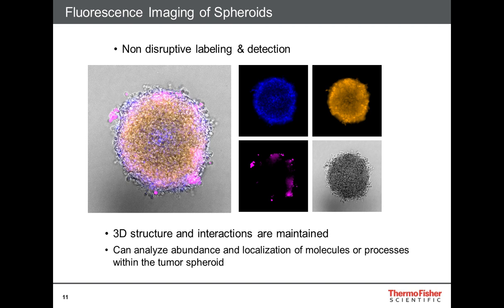So two things that are critical: counting our cells and then using an appropriate plasticware to grow a nice round spheroid. And so now when it's time to image these and evaluate the biology occurring inside these three-dimensional structures, fluorescence is really ideal because it provides us a way to not only label our cells and distribute a dye throughout the structure to report different functions, but to detect light given off by that sensor.